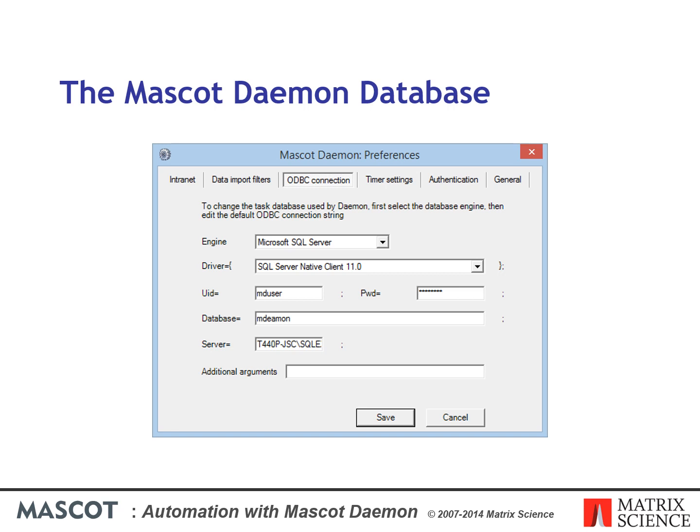When multiple instances of Daemon share the same task database, each task is owned by the instance that created it. You can only pause, resume, cancel, or delete your own tasks. However, any instance can clone any task and can transfer data files to any follow-up task, either by dragging and dropping the result node or by specifying the task in a follow-up criterion.